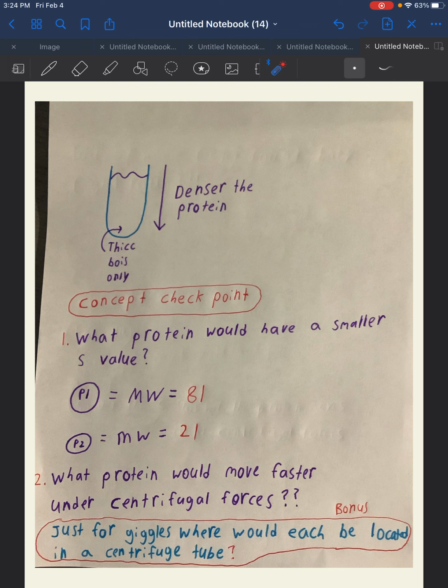And if you recall, the cytosol was here, and in that pellet, which was the dense cellular portions of the cell, such as the mitochondrial fragments, microsomal fragments, and nuclear fragments, were here at the bottom. And once again, if you recall, we did use a centrifugal force in order to separate those proteins from the fractions of those various cellular components.